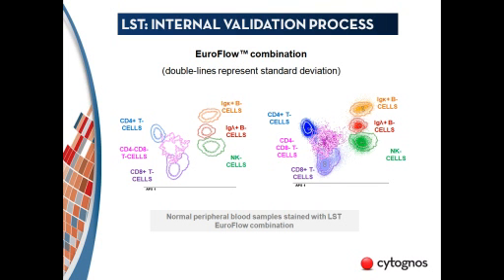We make this multidimensional analysis where all populations are separated, and then we plot on top of these normal samples a new combination that we are testing. We check that the expression of all the antibodies is similar to what EuroFlow is requesting in terms of fluorescent intensity, in terms of separation, in terms of quality instead of staining this background.